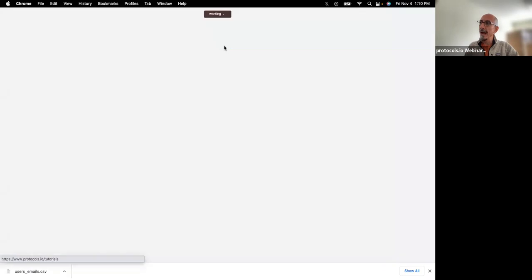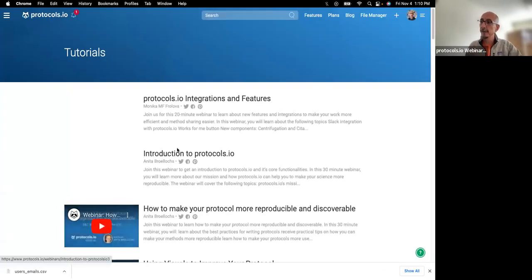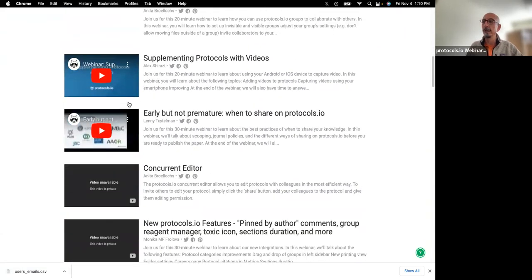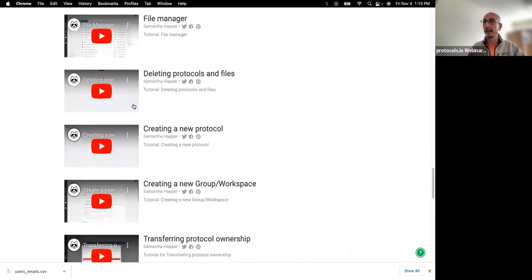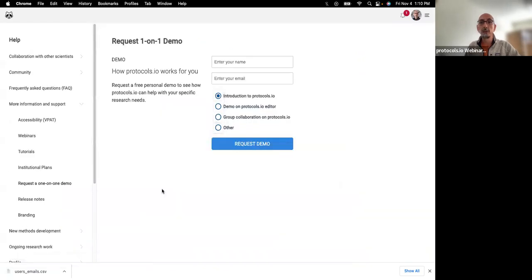We also have a series of pre-recorded tutorials that explain, with short videos, tools and features of the platform. And if you scroll all the way down, you will see that there is a link to request a one-to-one demo, which are interactive sessions for you to ask any question related to the platform.